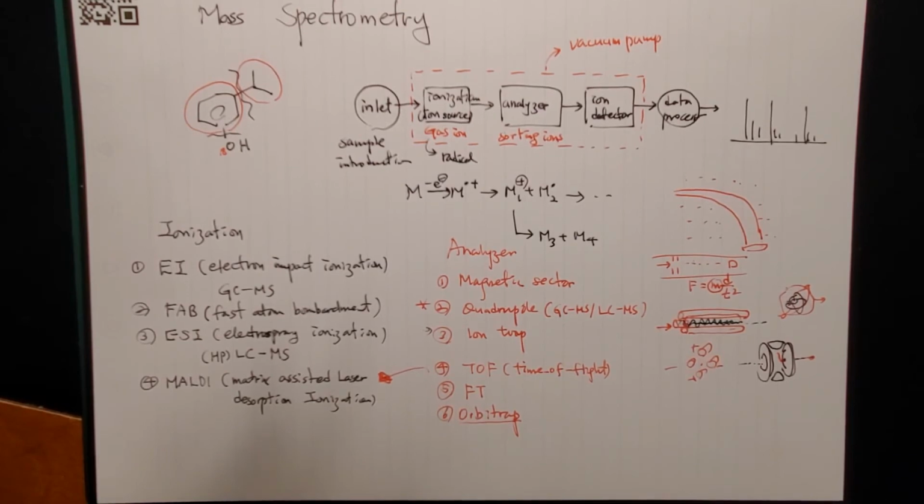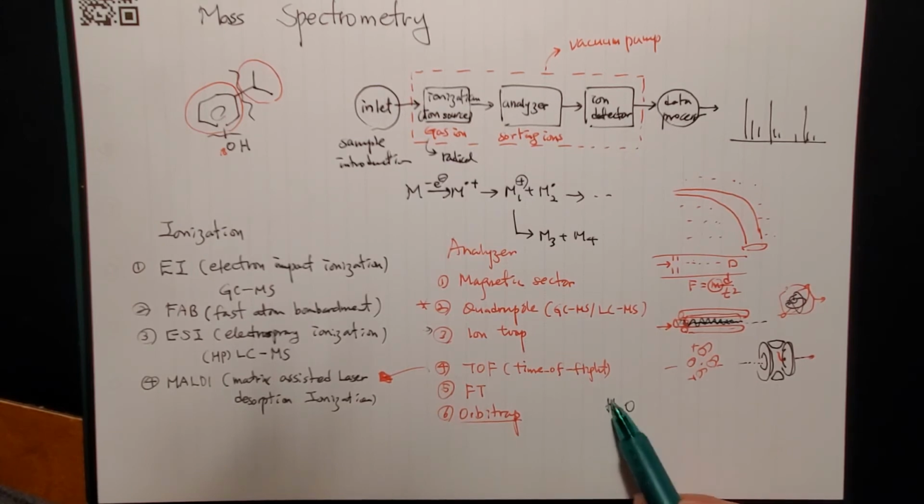And also advances have been made in the resolution and accuracy. So say if you have a water sample from some anthropology field, for example, you can exactly measure the ratio of the hydrogen or deuterium or oxygen 16 or oxygen 18 isotopes. So we can calculate the exact ratio. We can measure the exact ratio, so we can calculate the exact date.